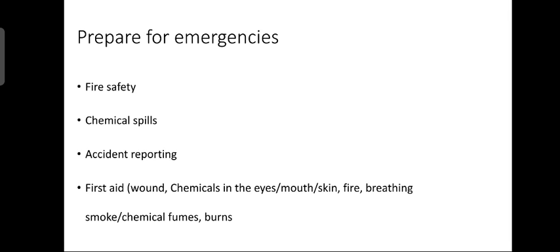Now, next let us see the fourth part, that is prepare for emergencies. In that, the first one is fire safety. Next is chemical spills. Third one is accident reporting, and fourth one is first aid. First aid for wounds, chemicals in the eyes or mouth or skin, fire, breathing smoke or chemical fumes, burns, etc.